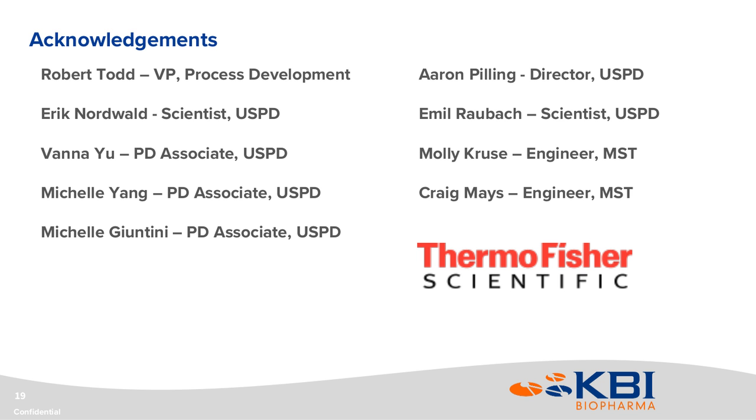Okay, good question. I would say the decreased operations around fermentation that I've talked about. I think I mentioned fermentation as a whole is about 75% custodial and 25% actual fermentation. So decreasing those resources around those operations in terms of sterilization and cleaning and validation allow us to be a little more flexible with our plant schedule and lab schedule and save time and, again, those resources. So lack of cleaning validation is also a big one that works in our facility as well, and has proven to be advantageous from a resource perspective, minimizing that need in single use.